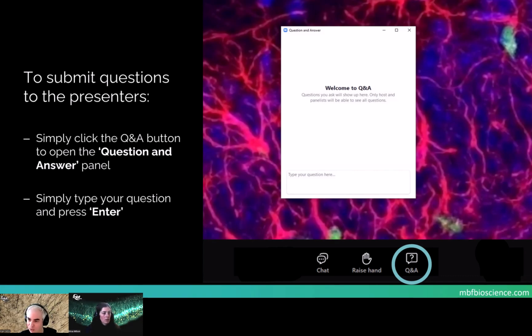Can one download the new program from the usual place? Right now, it's not in the download center, but we can discuss later. If you are interested in a trial, we can provide you with the software and the classifiers, which might be in separate files. We are doing evaluations with image data, and if you have images that work with our current classifiers, you can get a trial. And if not, we will work with you to create classifiers. So definitely interested to see what images you have.